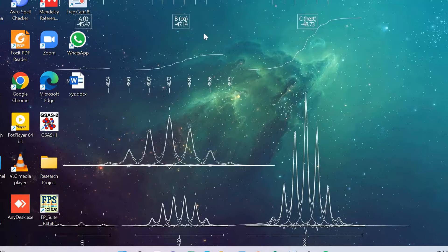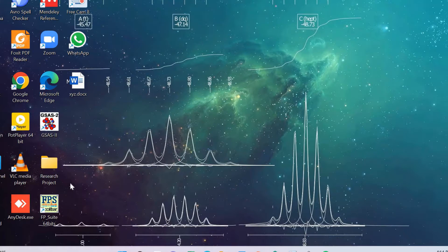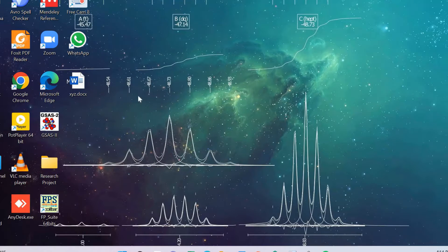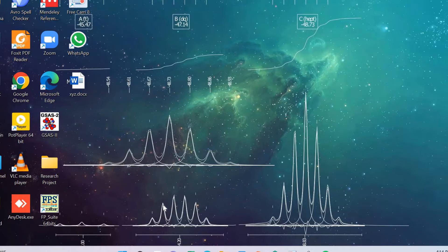Hello everybody. Today I will show you how to plot UV-Vis spectra in Origin. In this tutorial, we are going to calculate band gap from UV-Vis absorption spectra using the Tauc plot method.